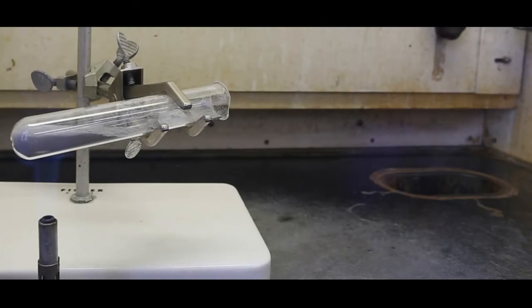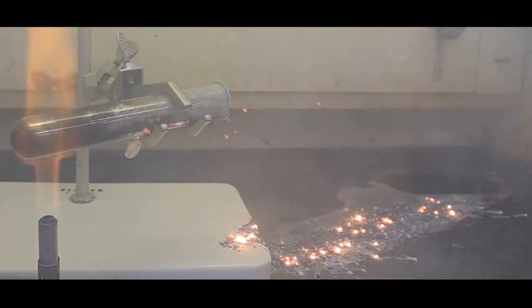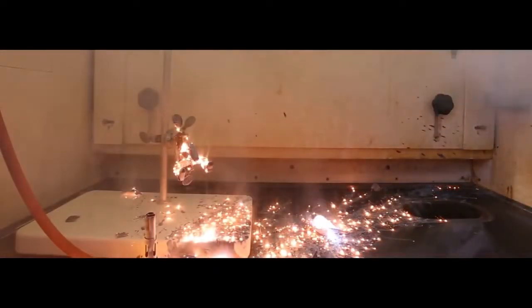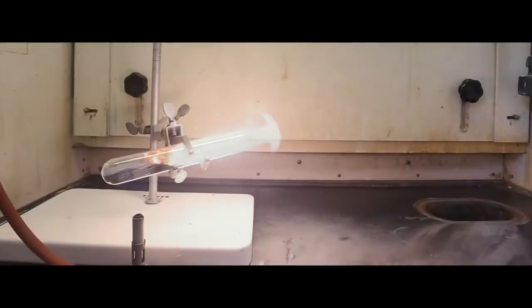You must also make sure that the heat source is at the bottom of the test tube. If the magnesium closer to the top of the test tube is ignited first, there's a possibility that the test tube can explode. I have actually recorded an example of this happening, and I'll show it to you in a second. This is an example of an improperly placed heat source. It is difficult to tell, but when slowed down, it is possible to see that the magnesium closer to the front of the test tube ignited first. And the undesirable effect is pretty obvious. This is a slowed down shot of the ignition.